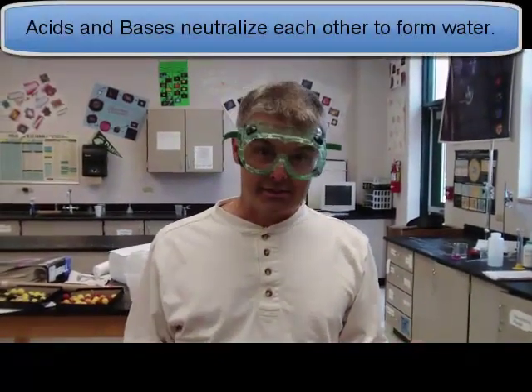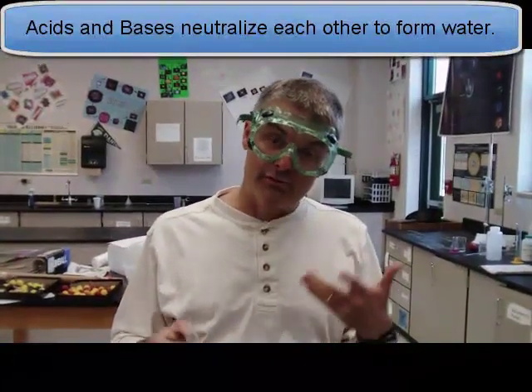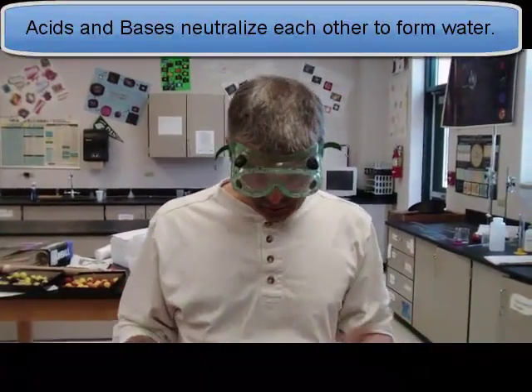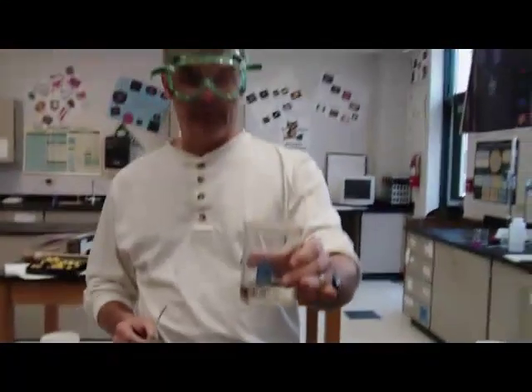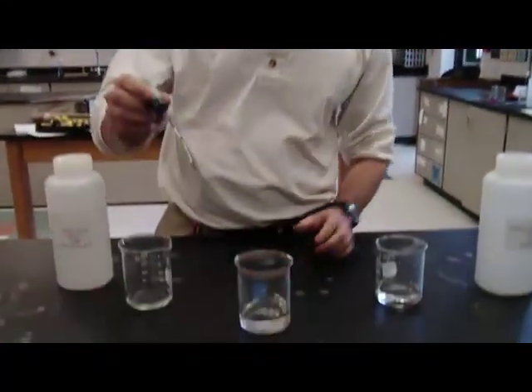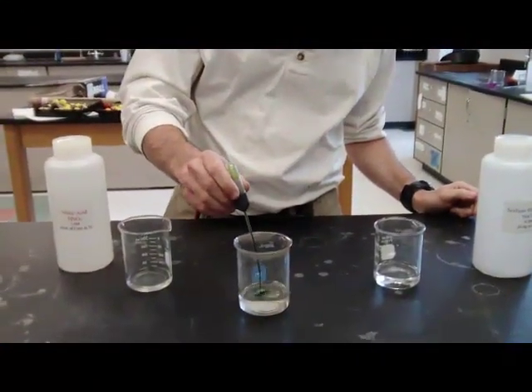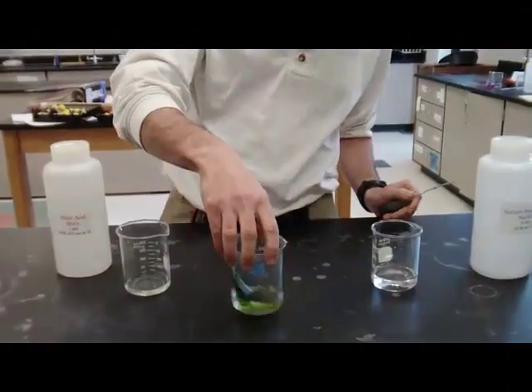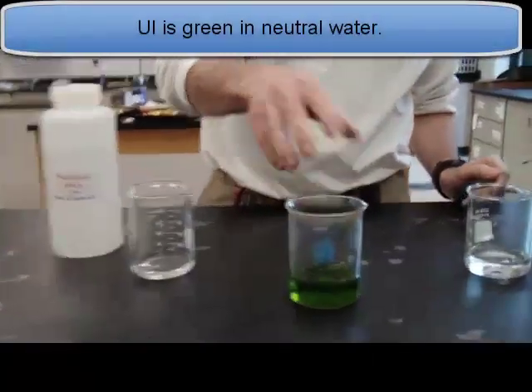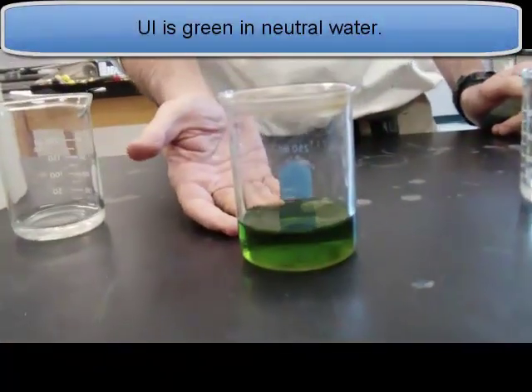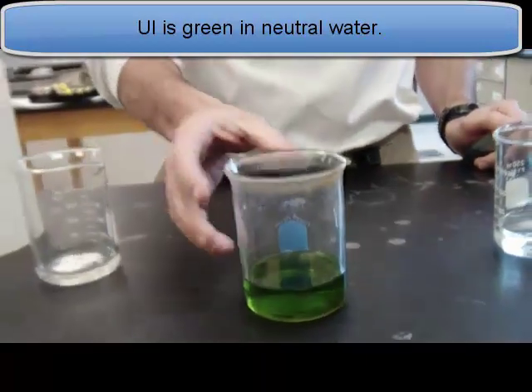Now, one thing about acids and bases is that they neutralize each other. Acid neutralizes base to form water. So I happen to have a beaker filled with water. Now, the way I can tell it's water, I have the indicator, universal indicator. I'm going to put a few drops in here, and it turns kind of a greenish color. So this is neutral water with a pH of roughly 7, probably a little off because it's tap water.